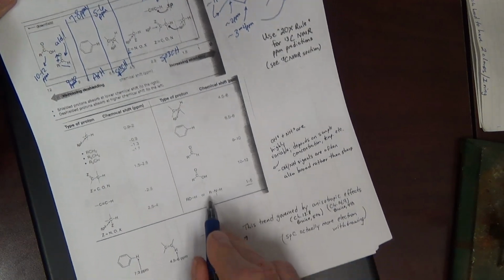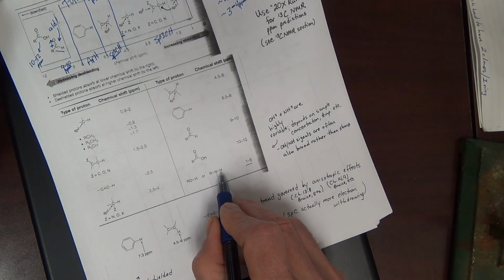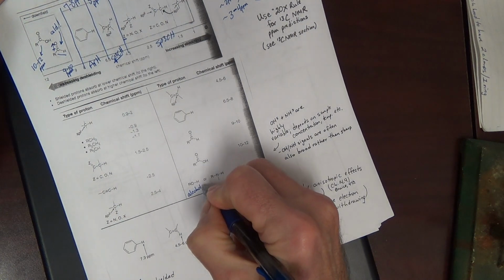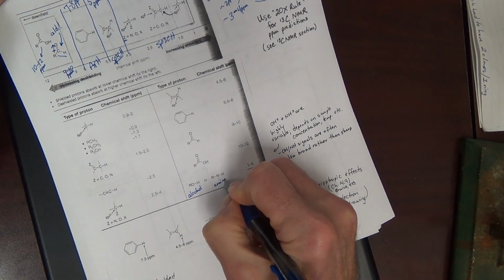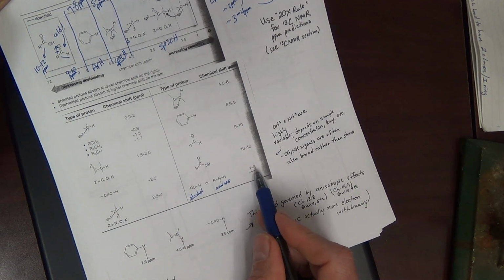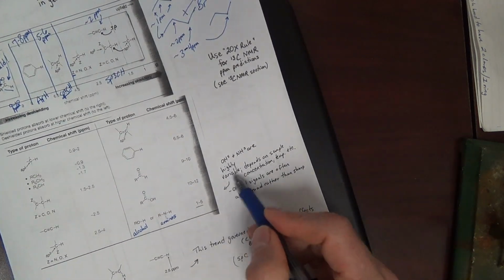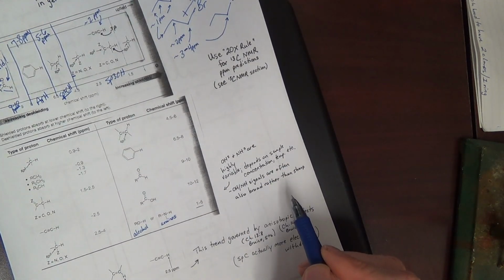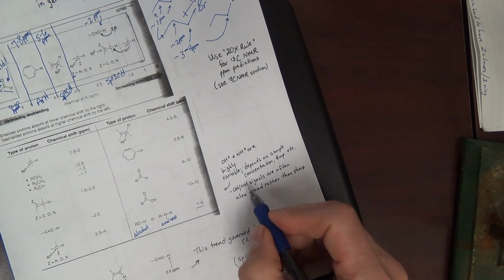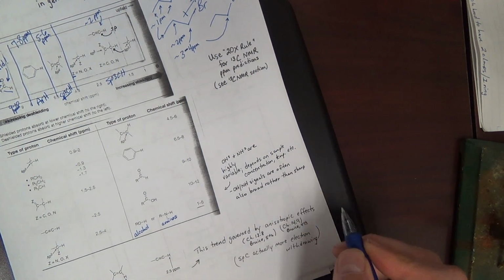The one thing that's shown here is that your OHs and NHs, now this being alcohols and amines, tend to be about 1 to 5 ppm, but highly variable. Also, OH and NH signals are often broad rather than sharp.